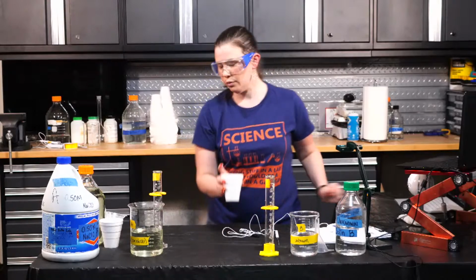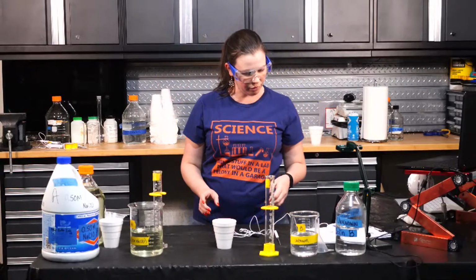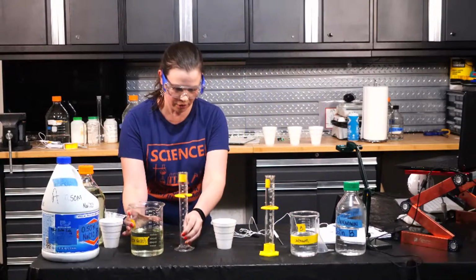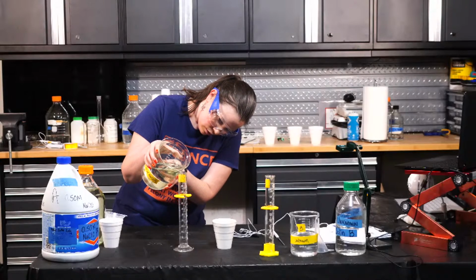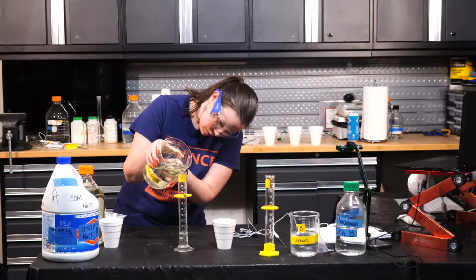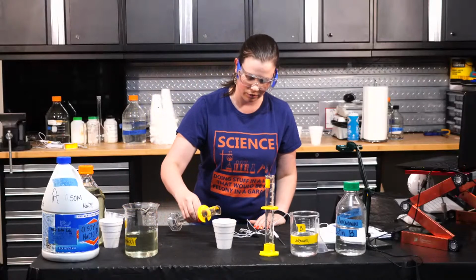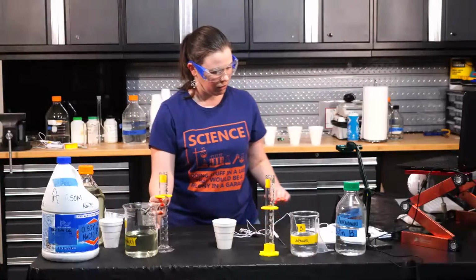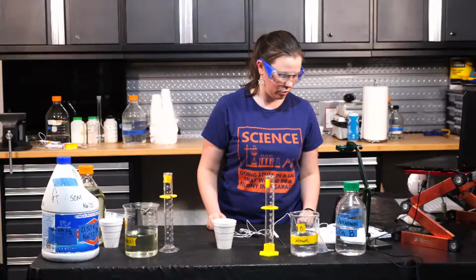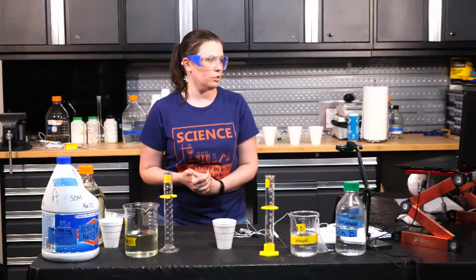All right, new cup. Now for level 5, we're doing 45 milliliters of bleach. So we'll go ahead and put our bleach in the cup. And then only 5 milliliters of solution B. So I think I've hit the point where I've got to go grab that graduated cylinder. It'll take me just a second to run to my room. I'll be right back.